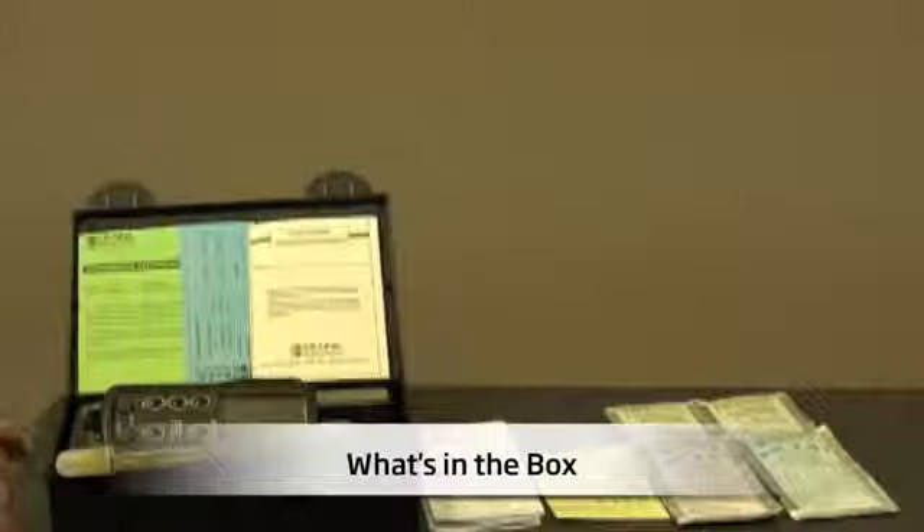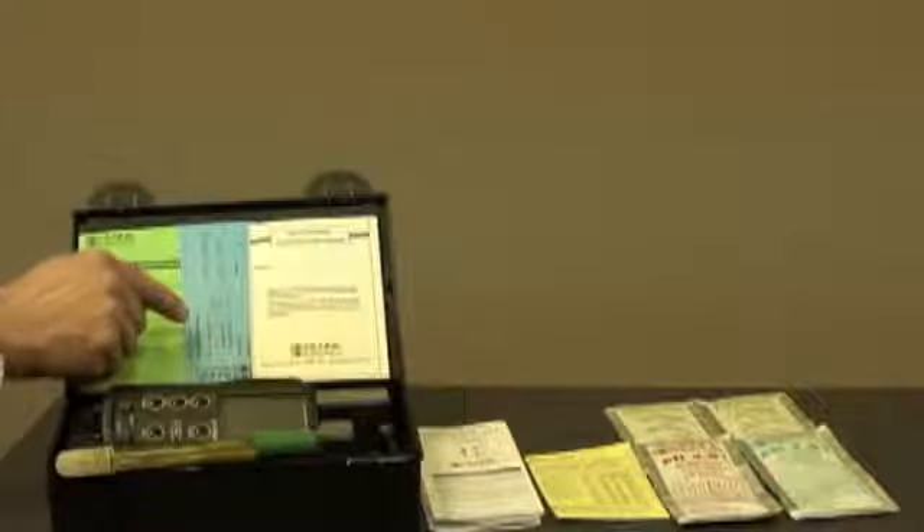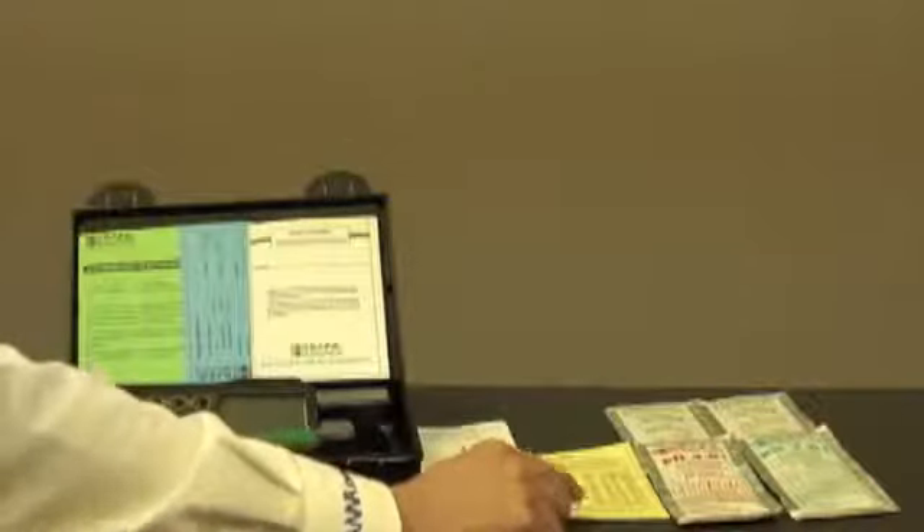Let me show you what's in the box. When your meter arrives, it'll come in this rugged plastic carrying case, complete with a calibration certificate for the meter, a testing certificate for your pH temperature electrode, the electrode instruction guide, the meter, pH temperature electrode, the all-important instruction guide, quick reference guide if needed, some buffers, and cleaning solutions.